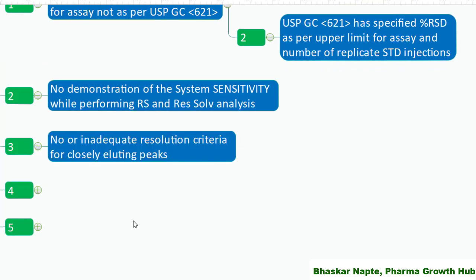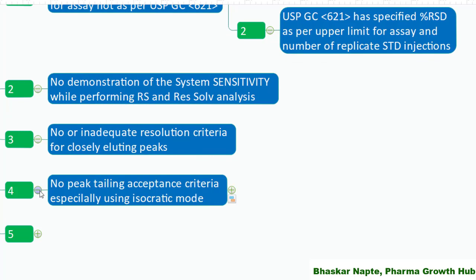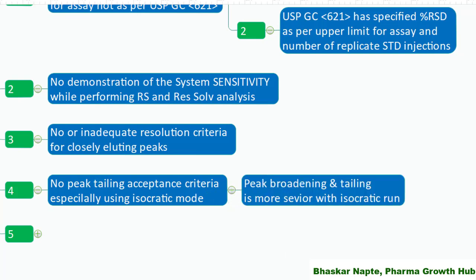No or inadequate resolution criteria for closely eluting peaks. Resolution is very important if you want to accurately integrate two peaks. Base-to-base separation is always preferred, but in the case of poor separation, the allowable minimum resolution must be included in the system suitability criteria. Also, no peak tailing acceptance criteria, especially in isocratic mode — you should have acceptance criteria for peak tailing, for example between 0.8 and 1.5, since peak broadening and tailing are more severe with isocratic runs.